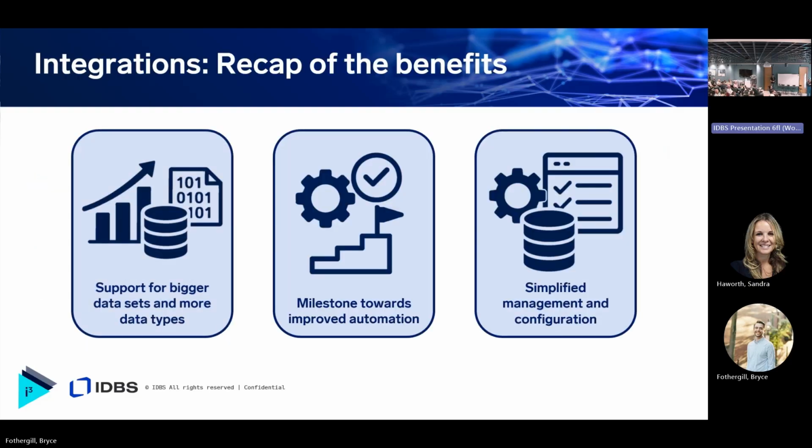So again, we're going to cover a bit of the recap of the benefits of integrations. So yesterday, Craig gave a presentation talking about the flow of data in and out, what that looks like, and IDBS's strategy for integrations. He gave three main benefits. The first being that integrations support bigger data sets and more data types. So with more and more data that you're able to access, that gives you greater insight for things later down the road. The second main benefit is that integrations serve as a sort of stepping stone towards improved automation.